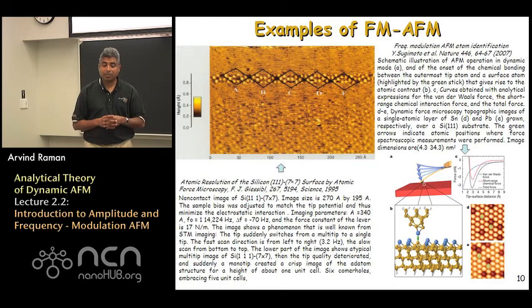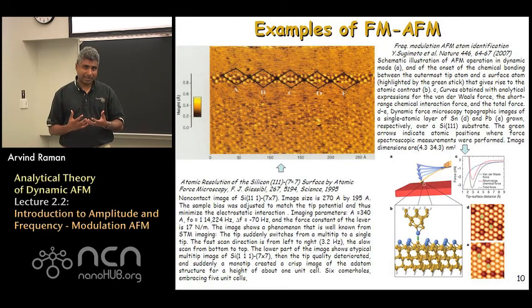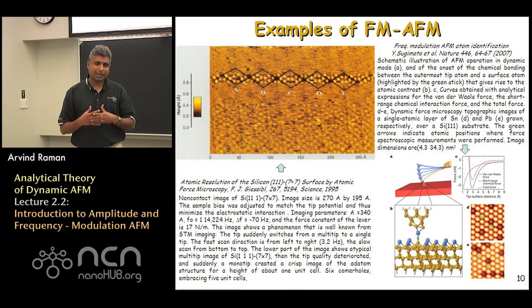This was a particularly important study that came out in Science because it was one of the most important surfaces whose atomic structure had been resolved using STM before. And before this particular paper came along, there was always a doubt whether dynamic AFM could achieve this atomic resolution required to reveal the structure of this silicon 111 surface.